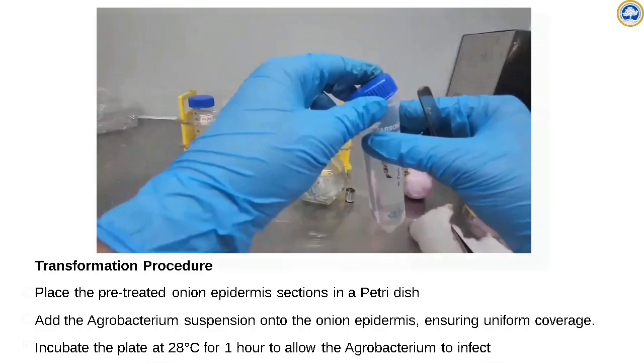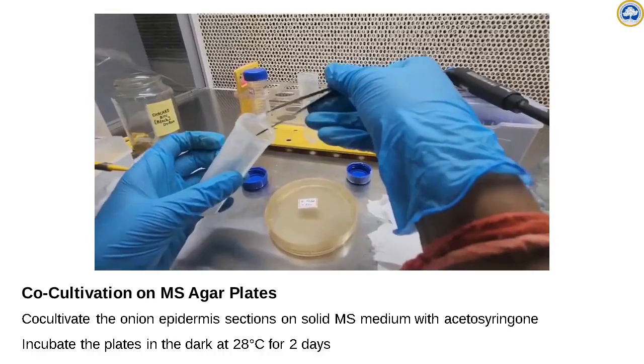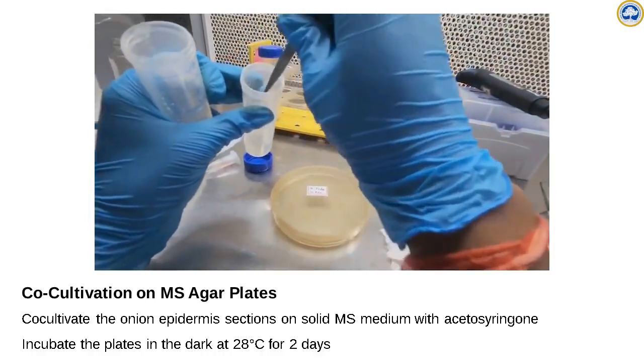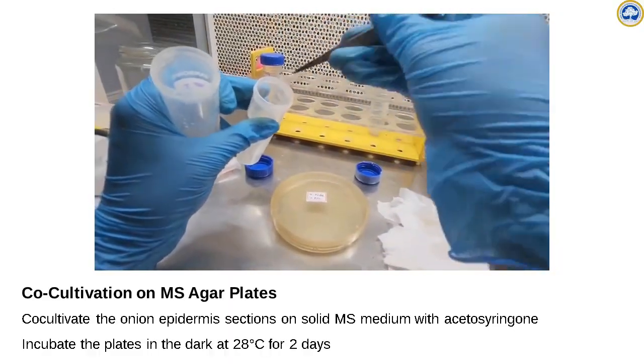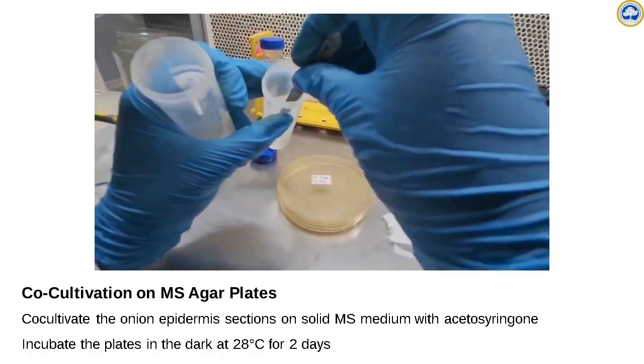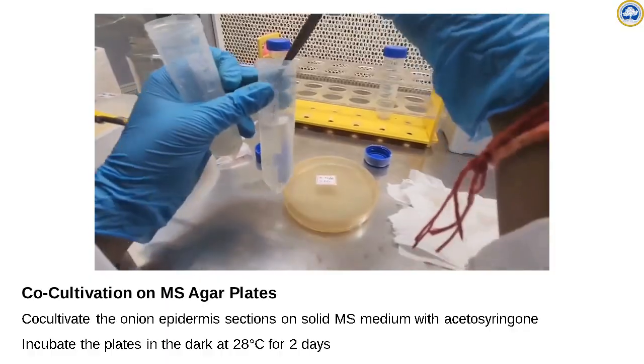infected onion epidermal tissues. So for co-cultivation, we prepare LB plates or MS plates, preferably MS plates with the required salt, sugar and hormones. You don't have to even add hormones.